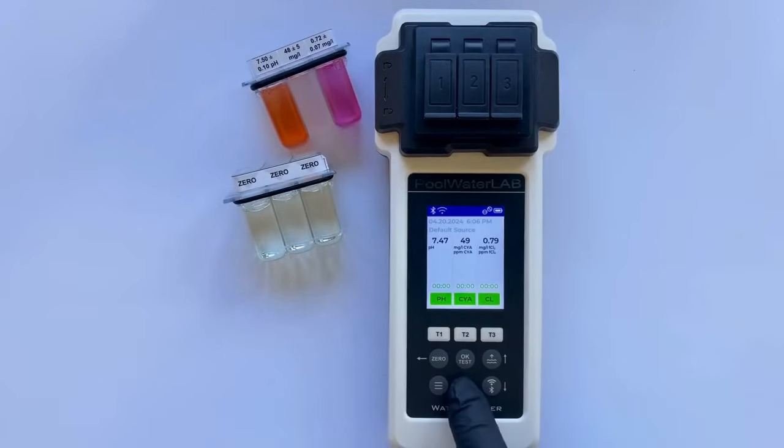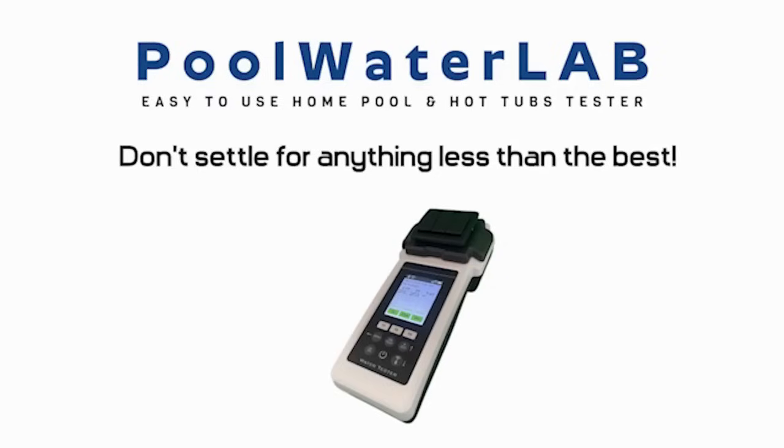To turn off the device, press and hold the off button. Pool water lab, perfect water, perfect moments, test, trust and dive in.